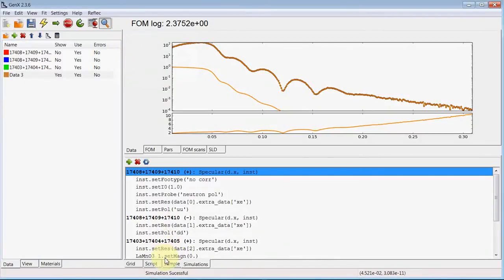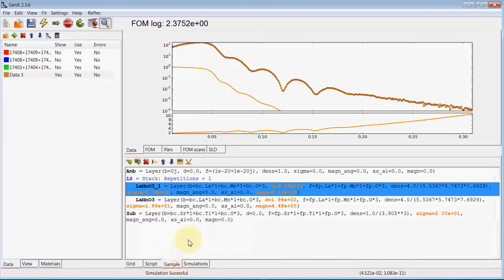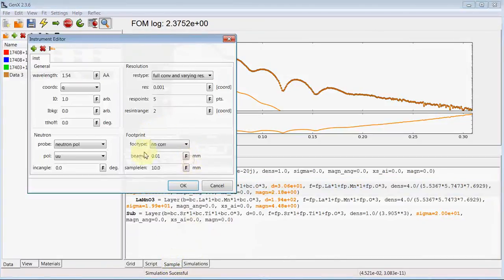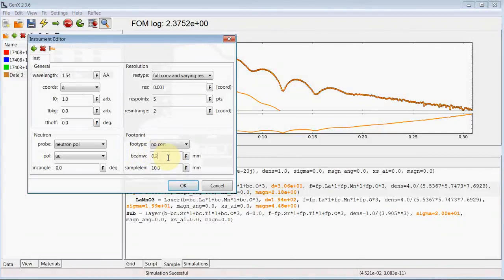The other parameters, as it is not used for neutrons, we can set in the sample edit instrument parameters. So we have beam width in this case 0.2 millimeters and a sample length of 10 millimeters.